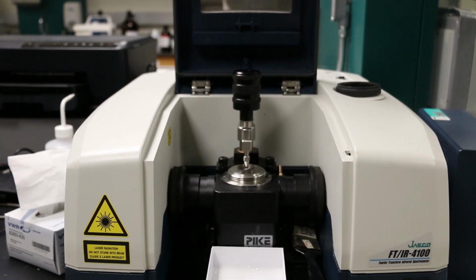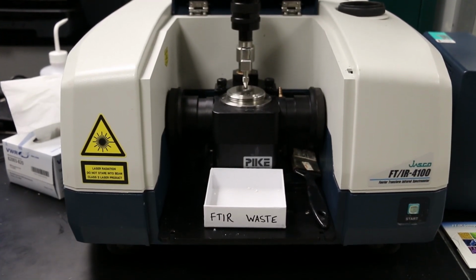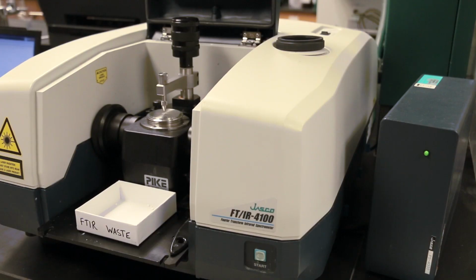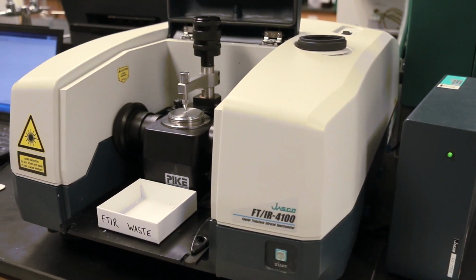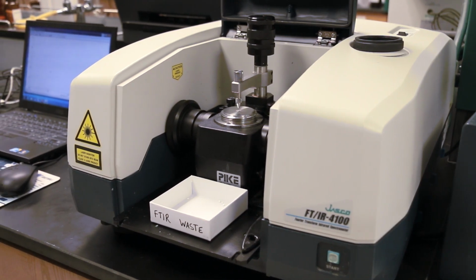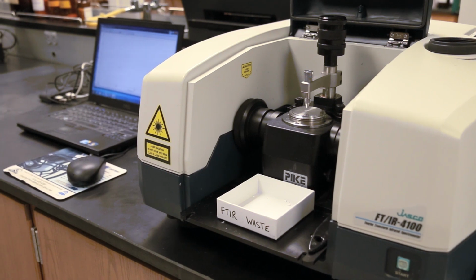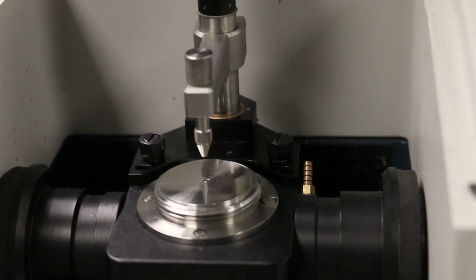The Jasco FTIR is an infrared spectrometer. Like spectrometers you may have used in earlier chem classes, the Jasco measures radiation after it passes through a sample. However, IR spectrometers don't use sample tubes to hold the compound or solution. Instead, our instrument uses an ATR cell to hold the sample.